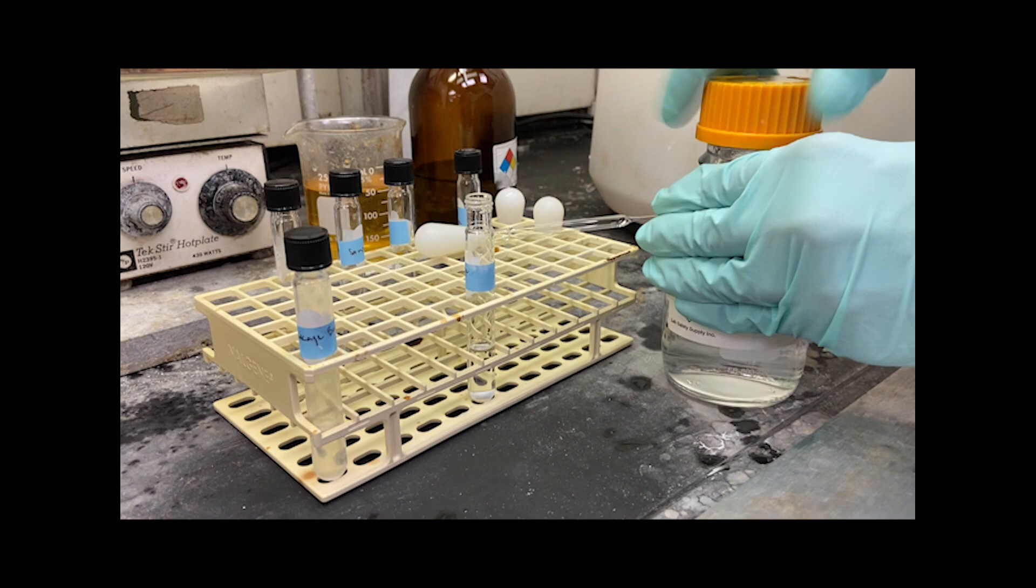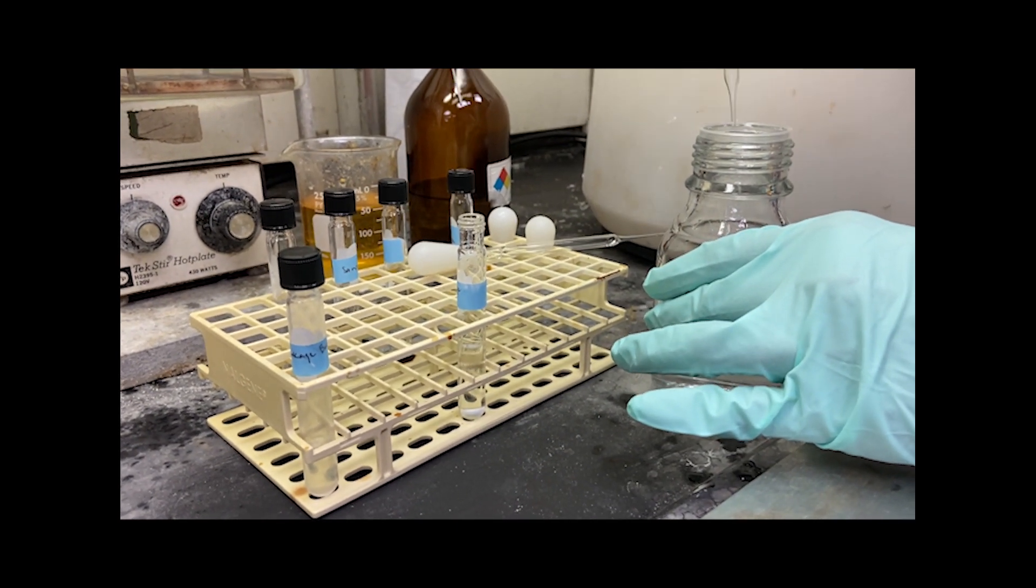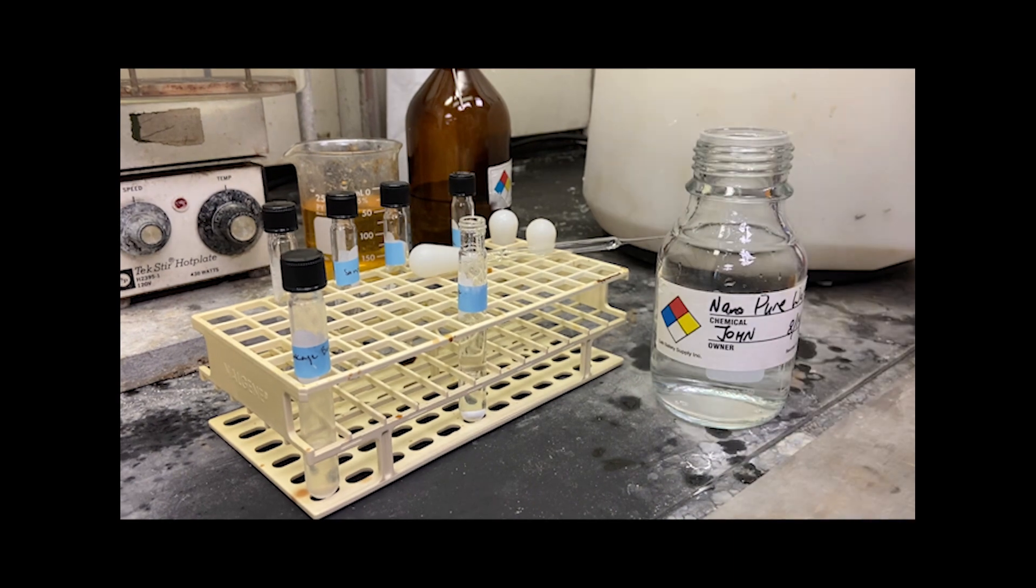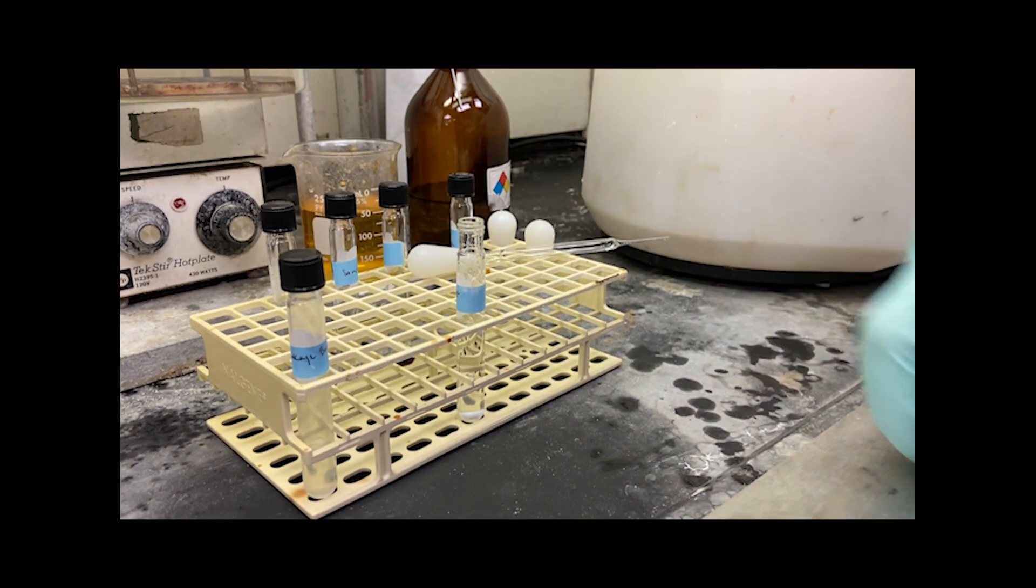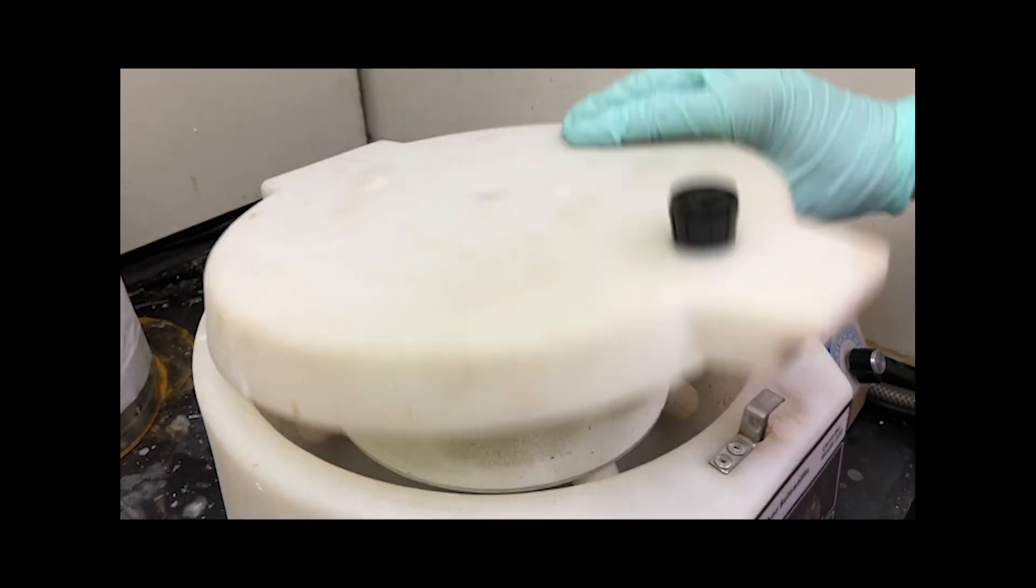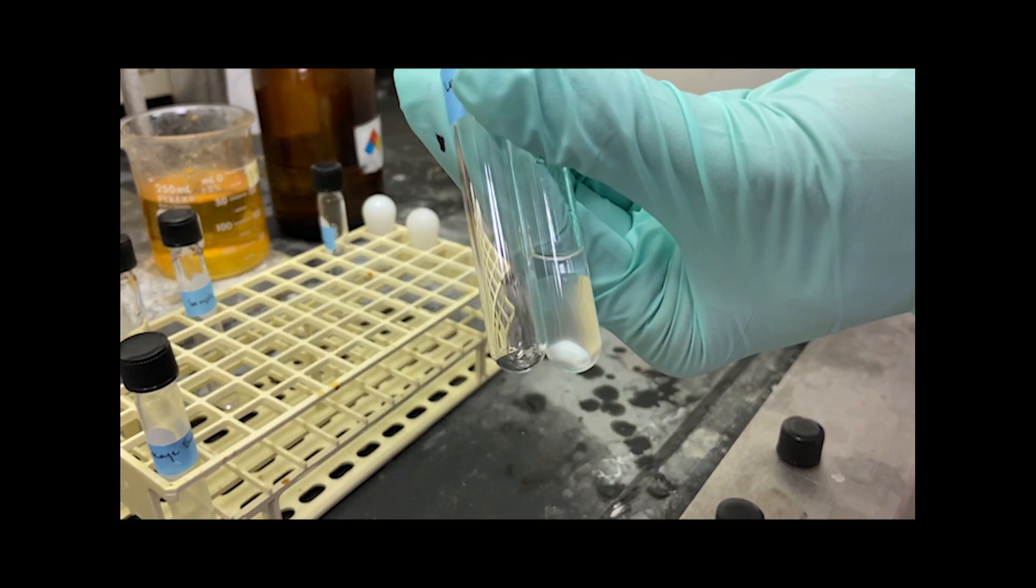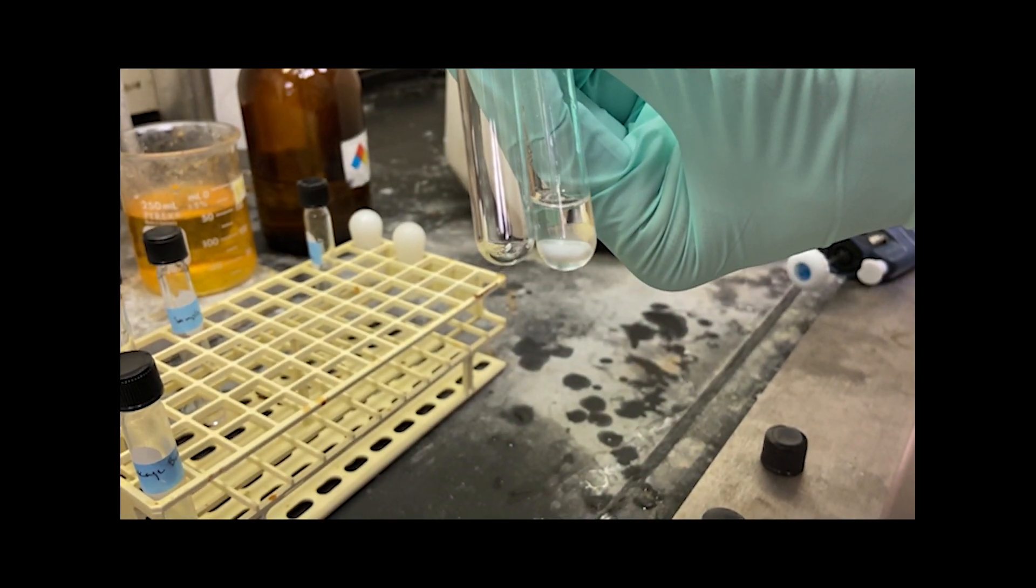This wash is repeated, with 2 more milliliters of water added to the sample, and once again vortexed and centrifuged, removing the water layer. This is in order to remove all the DMSO from the sample. This is repeated a total of 5 times, and finally the DCM layer is transferred to another tube to be dried down under nitrogen stream fully.